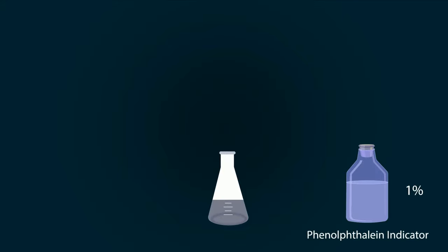Now add phenolphthalein indicator of 1% into the conical flask with the help of a dropper. Add two drops. The color will remain the same.